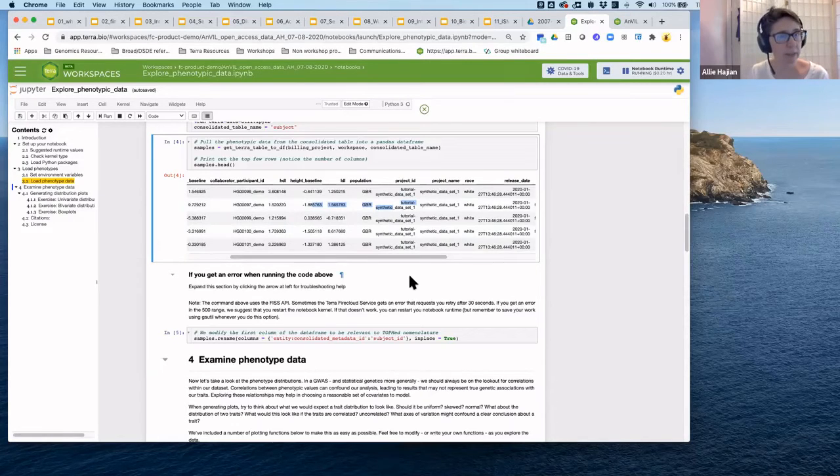At the end of this slide deck, there's a reference. We have a Notebooks Quick Start workspace, and if you haven't used Jupyter Notebooks before, it's a great place to get started. It's a very well documented workspace that goes through everything from how to type in a notebook to how to do analysis.